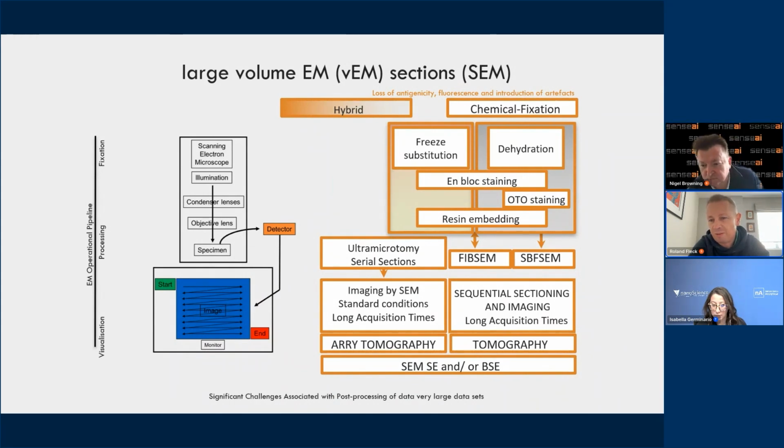Nigel, do you want to take over for a bit? Yeah, no, thanks very much for the introduction into volume EM, and you've sort of highlighted some of the issues in terms of the throughput. I wonder if there are other things that are challenged as well in the actual imaging process, or things related to the quality of the images that come out. Or what are the major challenges that are out there in terms of the resolution and the speed of what you can generate with the technique?